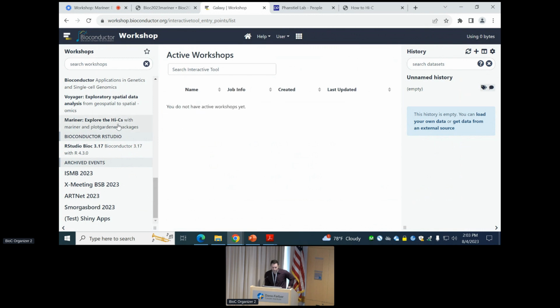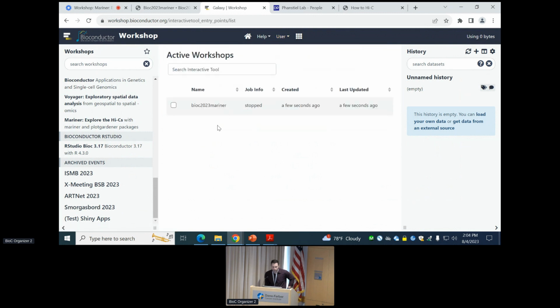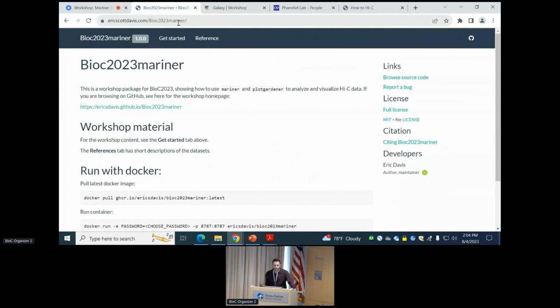Stop that one as well. And we'll wait for that to show up. But while we're waiting, if you want, you can navigate to this address here and follow along with the pre-rendered material. So I'll go ahead and start there while the workshops are loading.